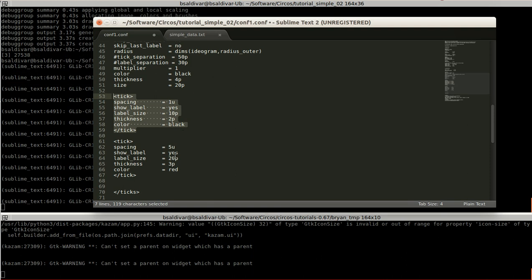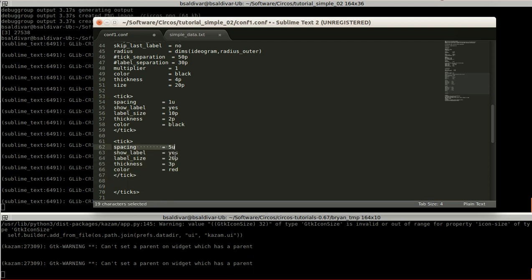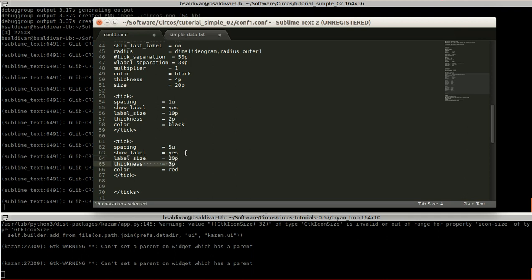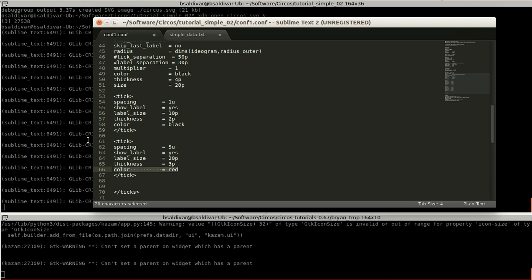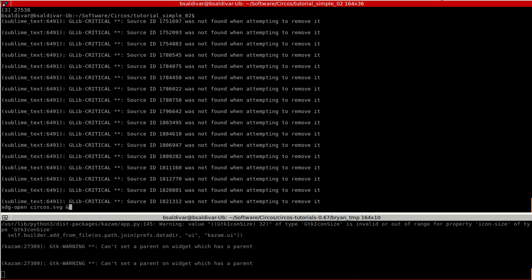And over here, we specify another rule for the ticks. That means that each five units there is going to be seen again, but it's going to be bigger, a bigger label. And also it's going to be thicker. And the color of these are going to be red. You have seen it already, but let's see again what I mean by this.